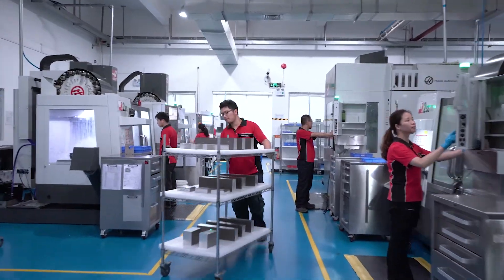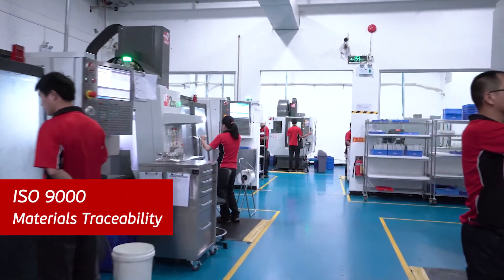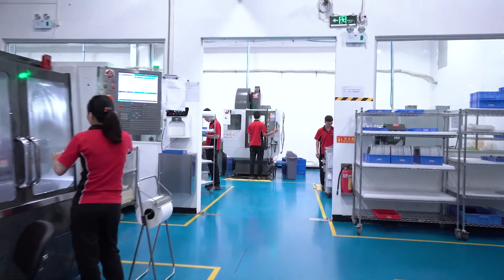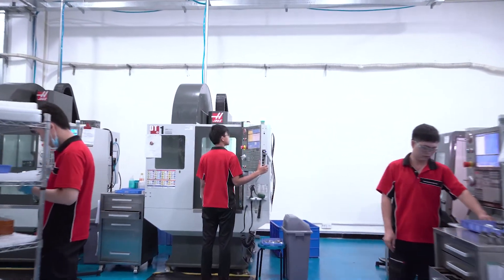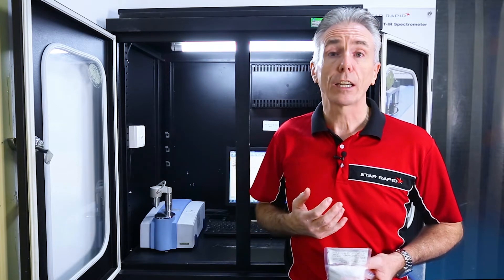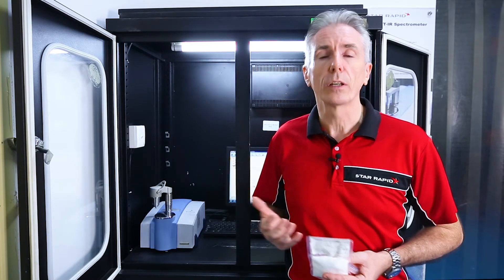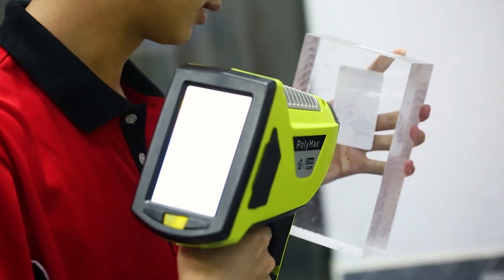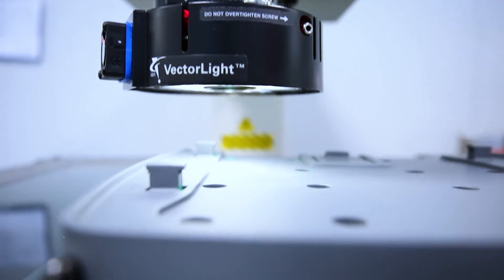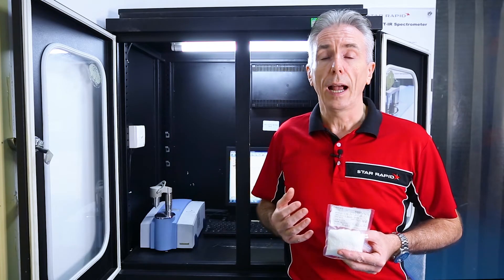One of the fundamental cornerstones of ISO 9000, which obviously we have, is materials traceability. This is a fundamentally important part of manufacturing. We have to be able to know where the material came from, whether it's the correct material arriving, and when the product leaves, whether it's still the correct material. We take inspection — whether it be materials inspection or size inspection, metrology — very, very seriously at Star Rapid.